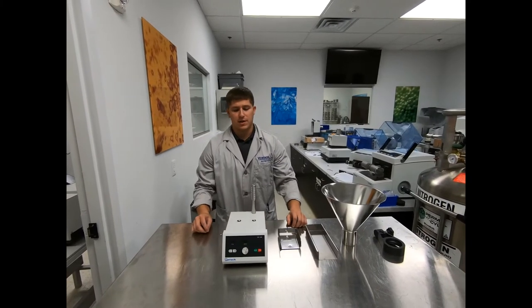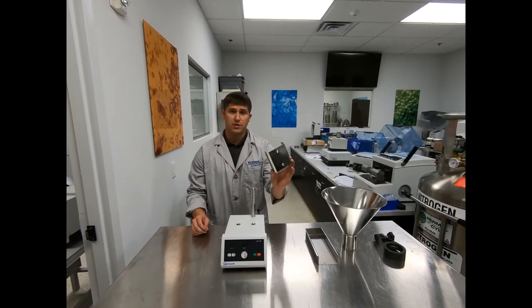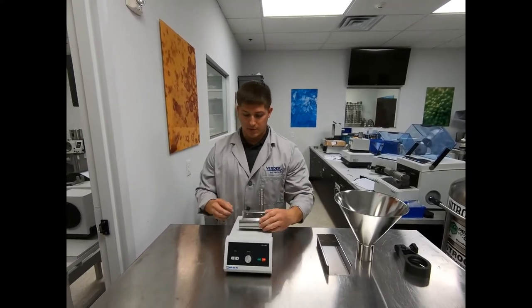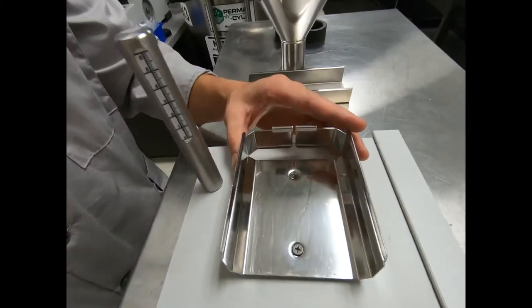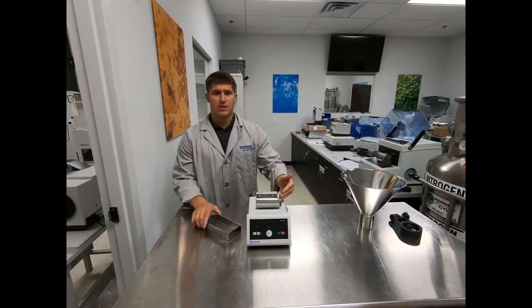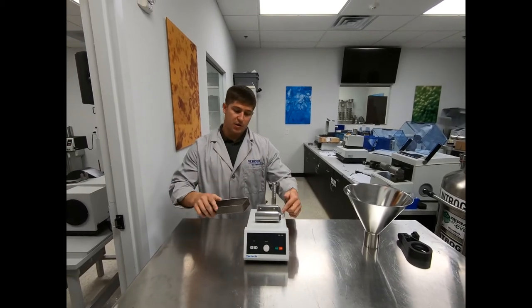The first step to assembling your DR100 vibratory feeder is to screw in the holder for the push feed chute by inserting two screws into the corresponding holes. Once the holder is fully screwed into the drive unit, the next step is to slide the push feed chute into the holder itself.